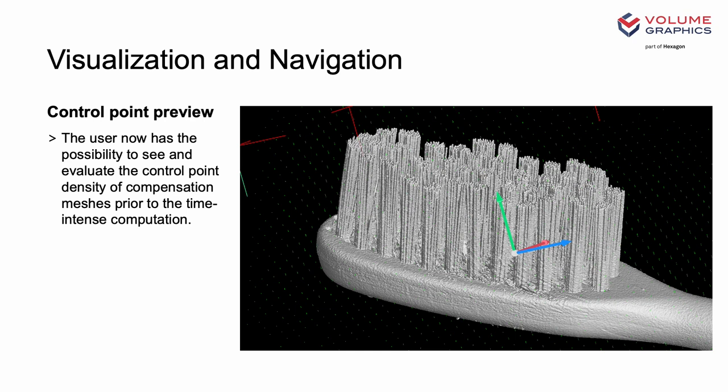There's another usability improvement when using the compensation mesh. Here we've eliminated the guesswork in terms of control point density because there's a preview. This means you can immediately get a better indication of how a compensation mesh is likely to be applied to your sample.